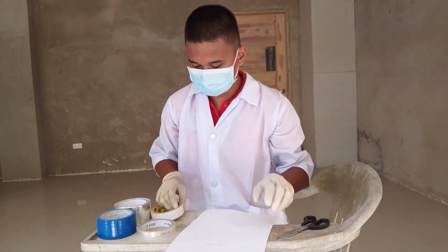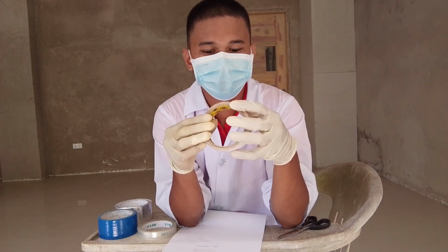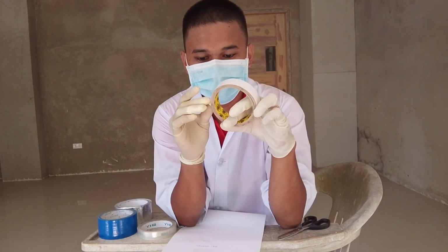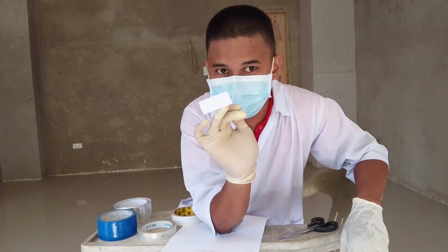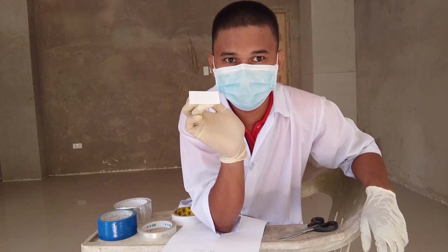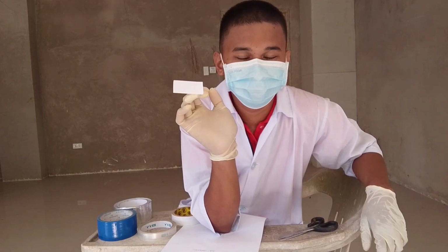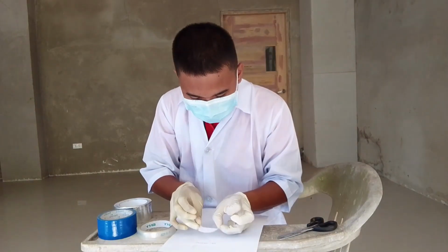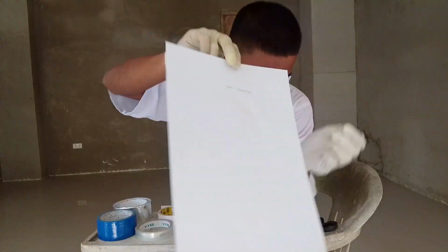I will now proceed to the next tape, which is the double-sided tape. The double-sided tape is also an adhesive tape, and it is commonly used for crafting, bonding things together, and mounting objects on the wall. I will now get a sample. I have here the sample. The size of this is 1 by 3 inches. The color of the double-sided tape is white, but the adhesive is transparent. The edge characteristic of the double-sided tape is flat also. I will now put the sample here. Now I will label it.